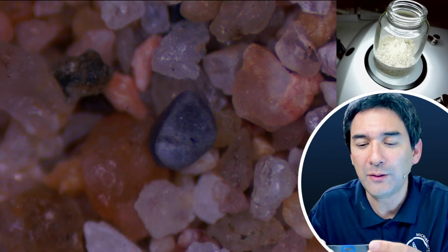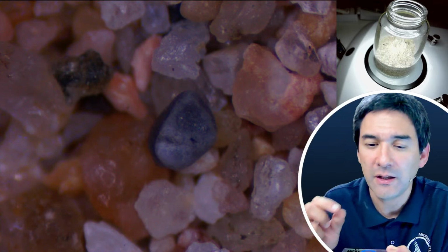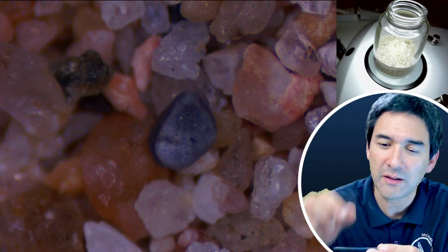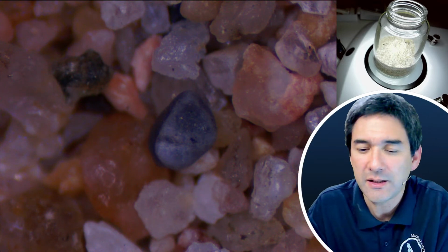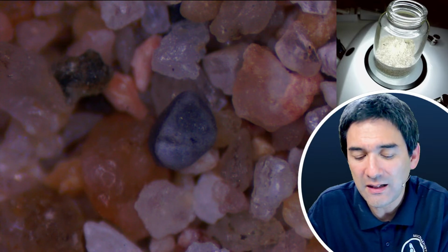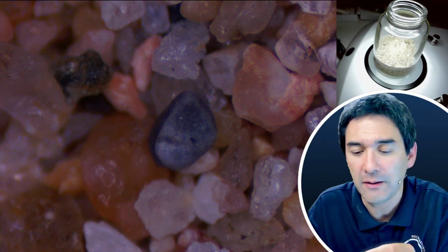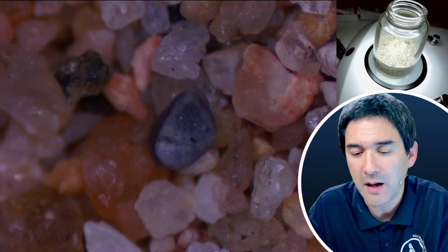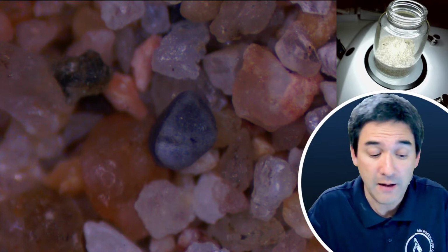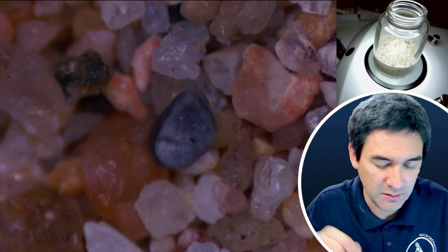The only thing that's a little bit annoying is that if you apply layer after layer after layer, the ring might become thicker and thicker, and you make a small mistake, and then it doesn't look as nice anymore. It's cosmetics. I don't see a problem with that, but I kind of think it might be a little bit difficult to actually make it a full millimeter high. So I would say, as often, you've got to try it out. I've actually worked with multiple layers before, but not quite as high as the ones that I have here.